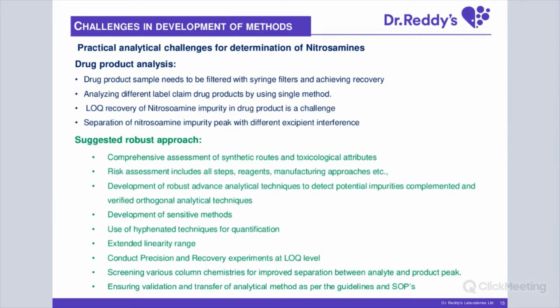And last but not least, I think validation and transfer of the methods need to be done in accordance with the internal SOPs. Every company will have their own SOPs, but it needs to be done very, very thoroughly.